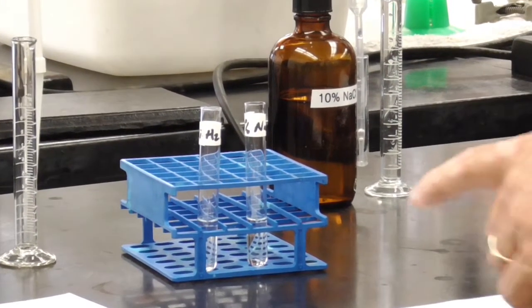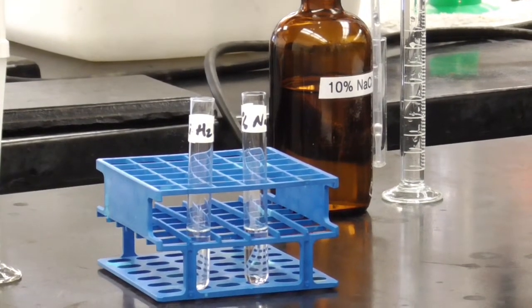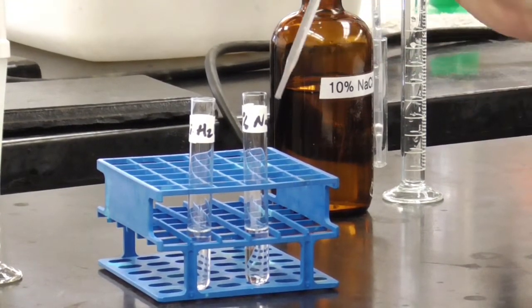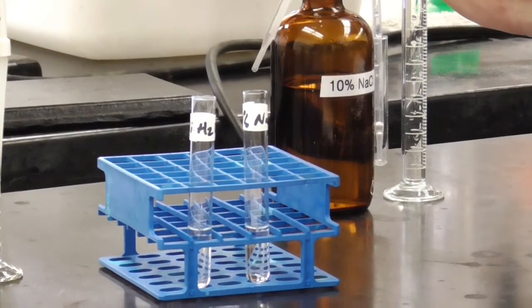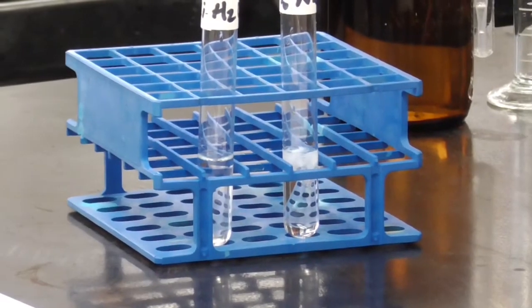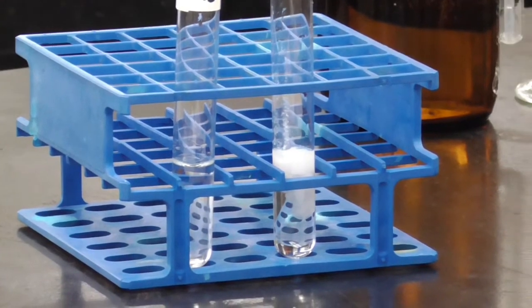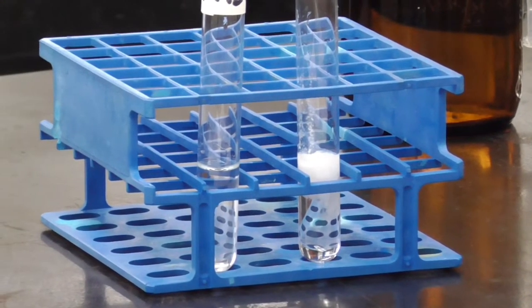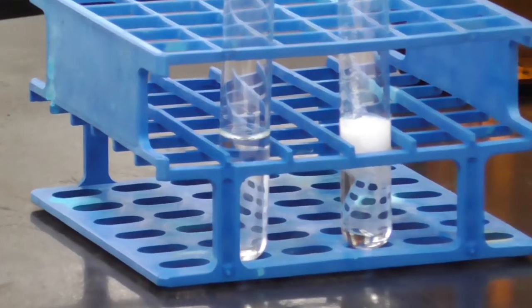I don't know if you were able to zoom in on that. Not much happened. Here we're going to put it in the positive test tube, the one with the sodium chloride, and watch what happens when I put the 2 drops in. 1 drop, 2 drops. Quite a bit of a difference.